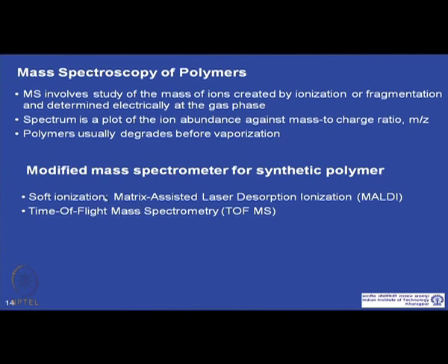One soft ionization mechanism is used, matrix assisted laser desorption ionization or MALDI, by which the polymers are vaporized with the help of a matrix without degradation. And we also use a second technique called time of flight mass spectroscopy, and in combination of these two techniques we get MALDI TOF MS, matrix assisted laser desorption ionization time of flight mass spectroscopy, which is nowadays very important and very common for polymer samples.